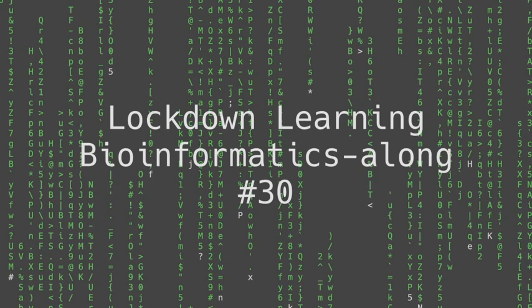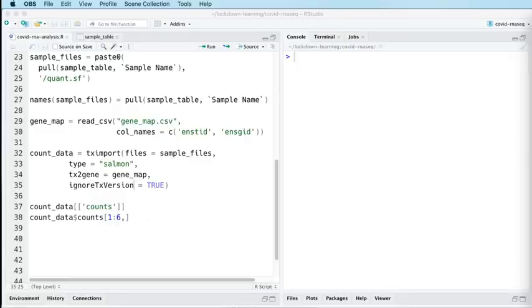Okay, so let's get R back. Sorry about that. There we go. Right, here we are. So yes, package installation. That's the first thing that we want to do.